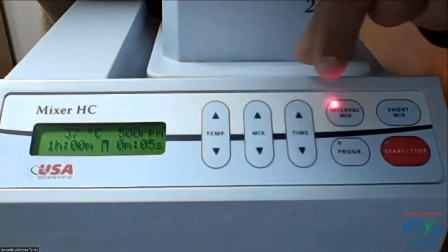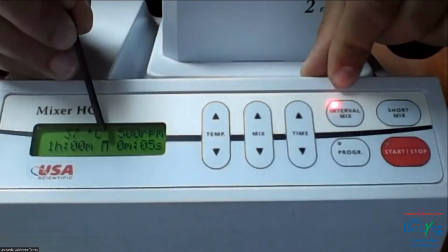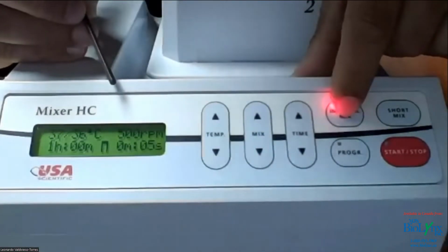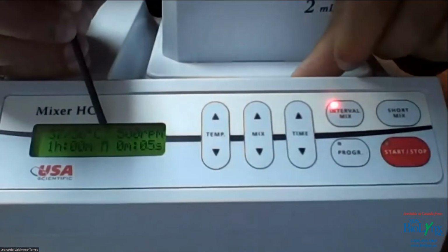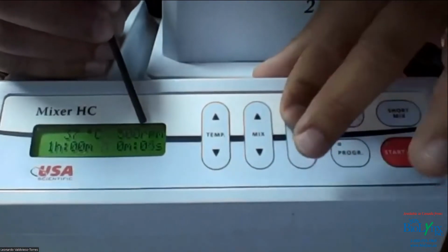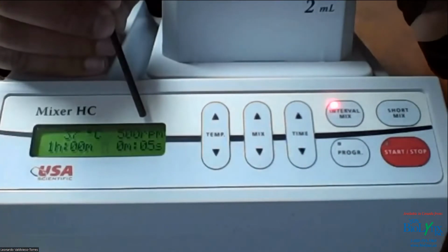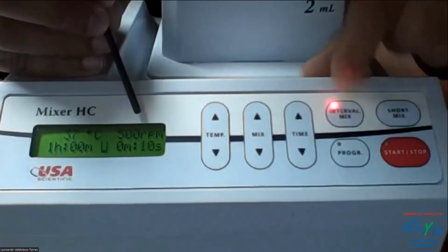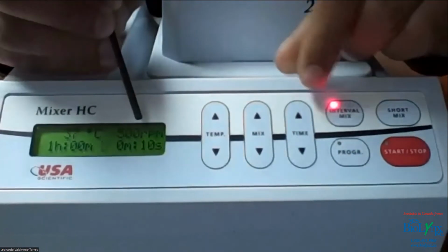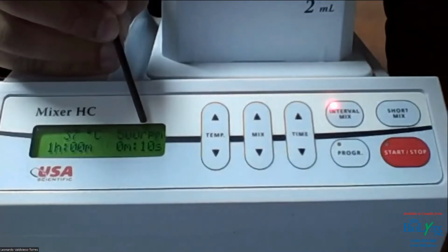Okay, so can you see that upside down U that I'm pointing? Yep. Okay, so when it's pointing down, that is the mixing time. So I click again. When it's blinking is when you can actually adjust the time that is gonna be mixing. So now when I click down, you can see that the seconds are changing here. So I'm gonna set it up at 5 seconds just for the purpose of this webinar. And then I'm gonna click again and you can see it looks like a U now, which is gonna be the pause time. It's set up already at 10 seconds, but I just wanna show you that you can change it to whatever time you want.